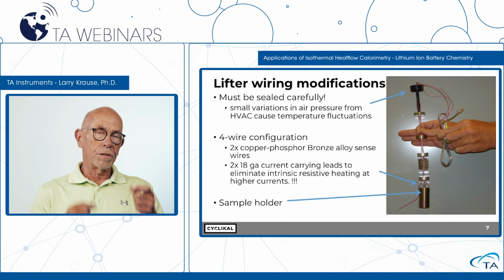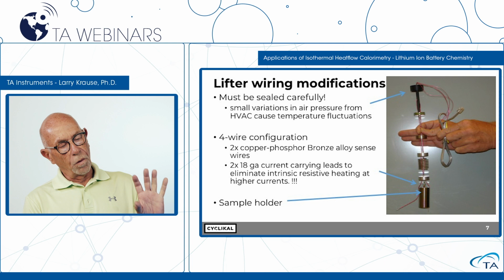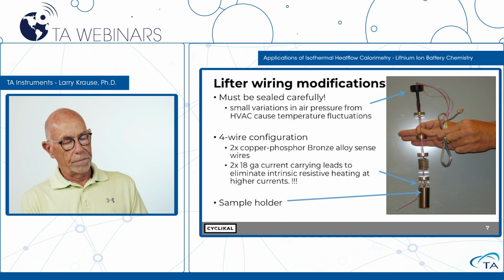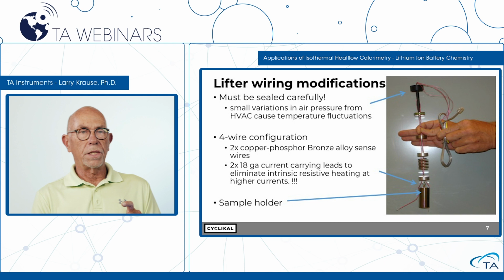So to solve that, what we had to do was make a junction just under this second thermal shunt, where we connected an 18 gauge copper wire to the 32 AWG wire and ran that down into the sample holder and connected to the battery. So now we have the four wire 32 AWG coming down through the second thermal shunt, and then the current carrying wires become 18 gauge copper wire down to the sample holder, soldered to the battery, and our voltage sense leads are still the 32 AWG. And that worked quite well.